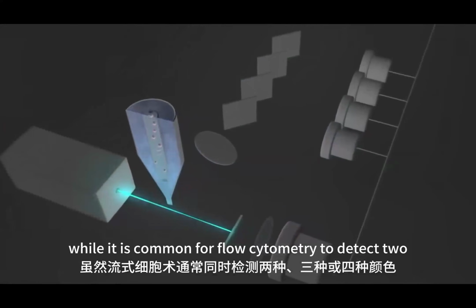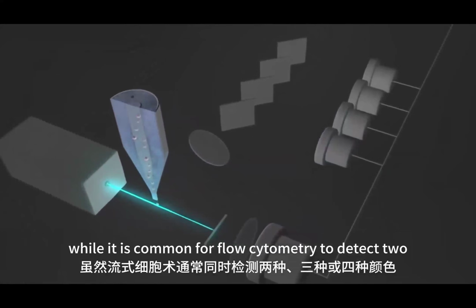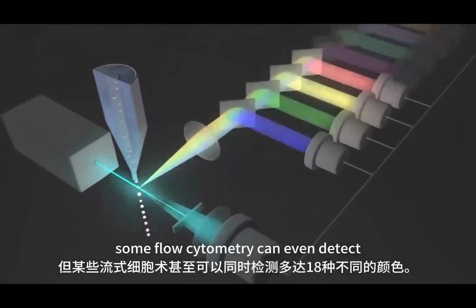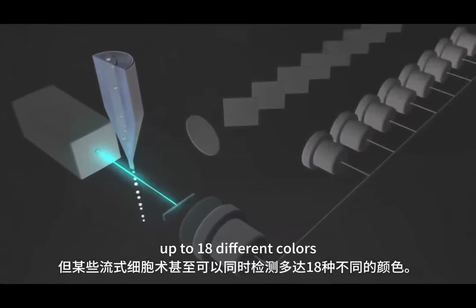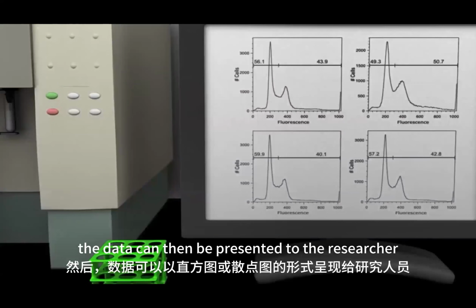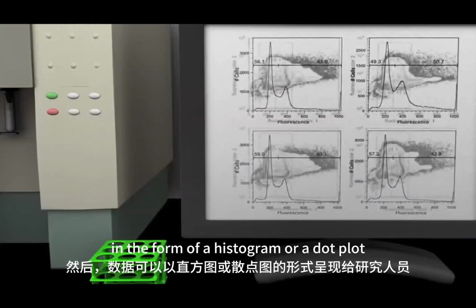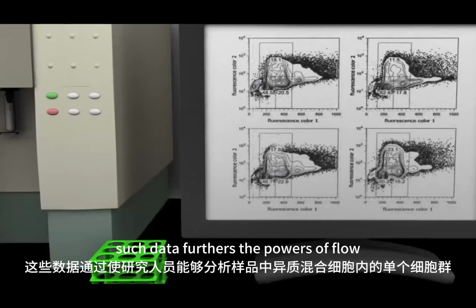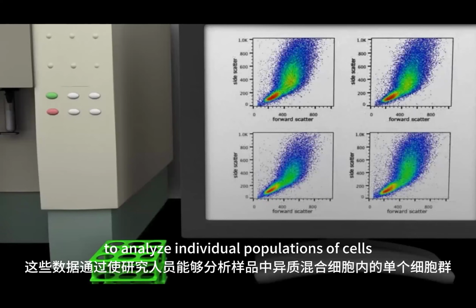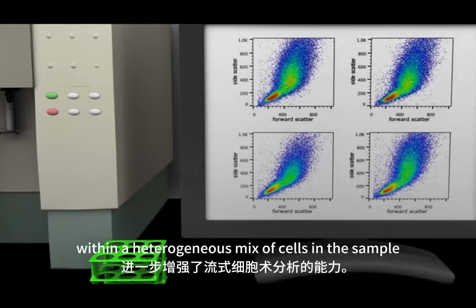While it is common for flow cytometers to detect 2, 3, or 4 colors at the same time, some flow cytometers can even detect up to 18 different colors at the same time. The data can then be presented to the researcher in the form of a histogram or a dot plot. Such data furthers the powers of flow cytometry analysis by enabling the researcher to analyze individual populations of cells within a heterogeneous mix of cells in the sample.